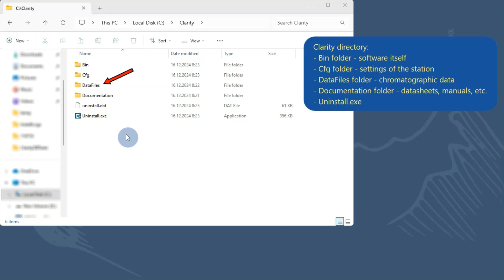The data files folder, that contains all the chromatographic data. The documentation folder, that includes datasheets and manuals for this version of the software. And a file uninstall.exe used to uninstall Clarity.